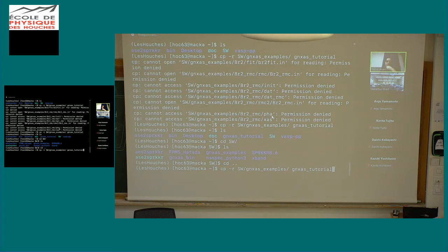Can you see my terminal, okay? So, okay, I will go on. No, we can see. Okay, so there's no problem, yes.